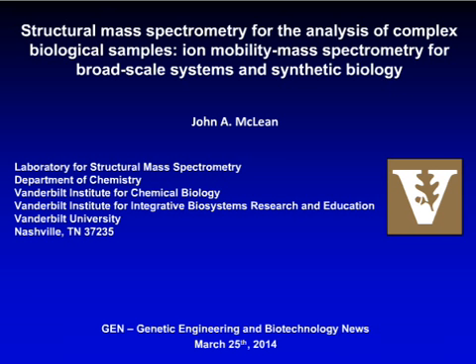George and Erin have both really demonstrated some of the points that I would like to make today. What I'd really like to convey is our belief that very fast separations using ion mobility mass spectrometry provide a tool well suited for very complex biological mixtures, like those encountered in broad-scale systems and synthetic biology.